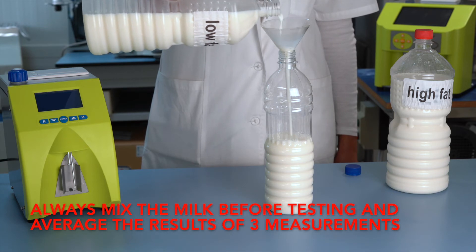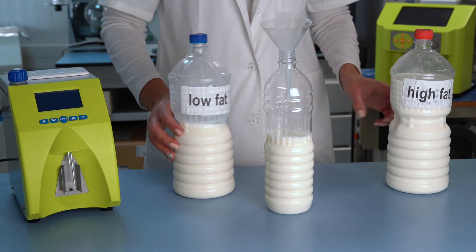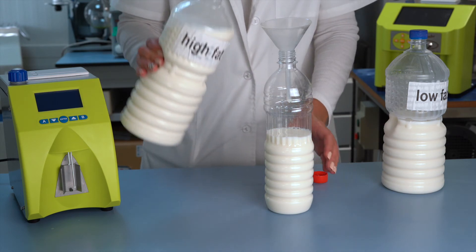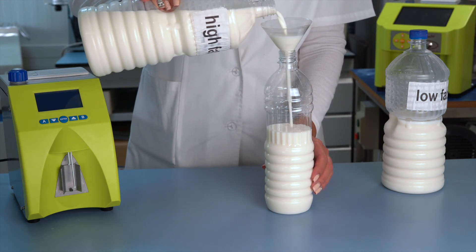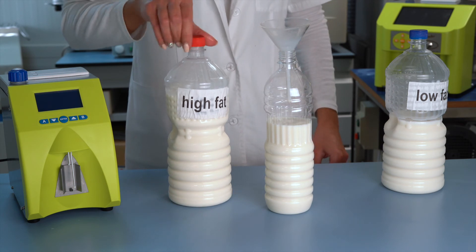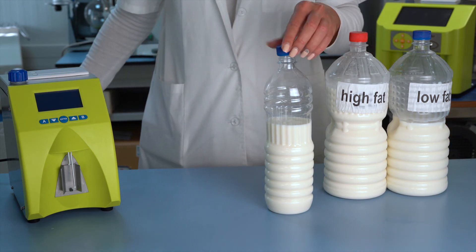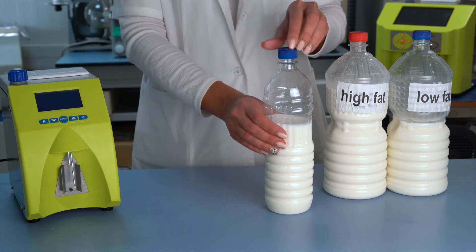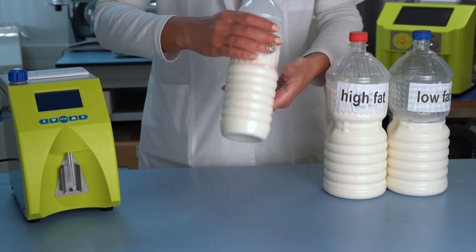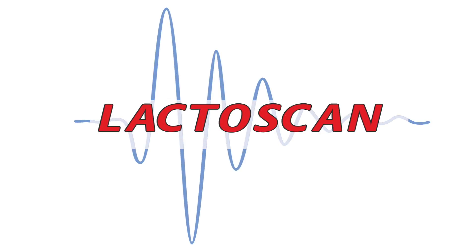Always mix the milk before testing and average the results of three measurements. Thank you so much for watching.